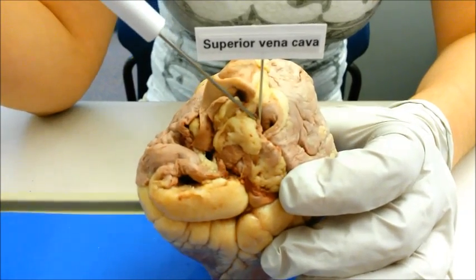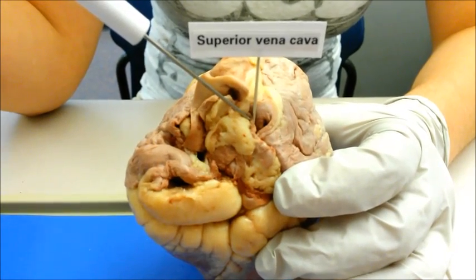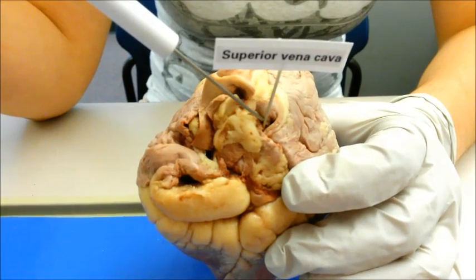The superior vena cava, also called the pre-cava, is a vein carrying deoxygenated blood to the right atrium. This vein is wide and short and receives blood from the upper body, for example from the arms, neck, or head.